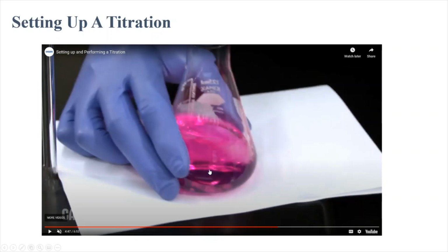They calculate how much he added. You have to add about 10 mL, and the solution is going to change color somewhere before 10 mL, maybe about half a mL before. So now they know, okay, 10 mL is too much. So I'm going to do my next titration and go to about 5 or 6 mL, which I know should be totally safe because it's going to change around 9.5.